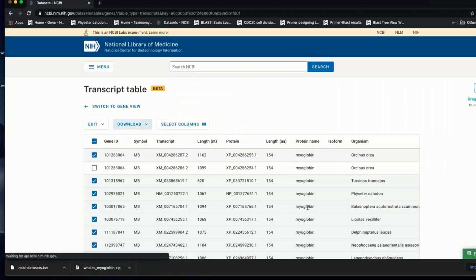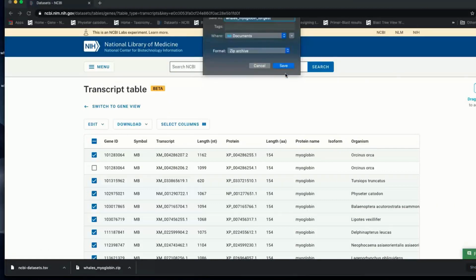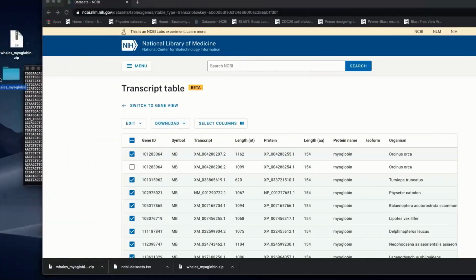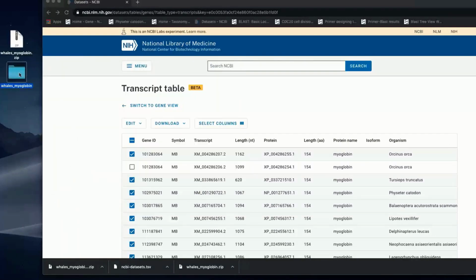And here I'm just going to make a little note because it is in beta. If you're in Chrome, it will actually download a zip file. Don't be surprised if you're in Safari or Firefox. It may not work. So just switch browsers if it doesn't actually download a file. And then I'm having a little issue with unzipping, so I already had unzipped it on my computer so I could show you guys what kind of information you get. So sorry, I'm just going to switch over to here real quick.